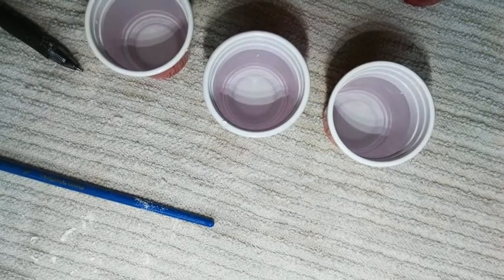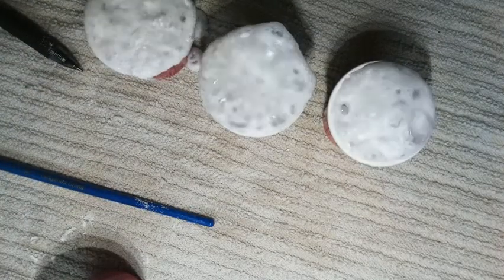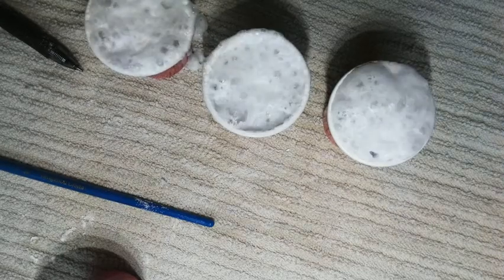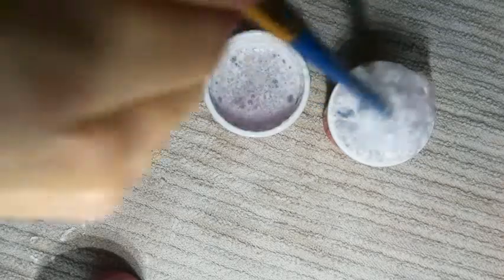All right, let's get these guys situated to go. And we'll dump and get started as soon as we can get the dumping in there. 1, whoa, 2, whoa, 3. Uh-oh, we had a little bit of spillage here. That was a pretty vigorous reaction, wasn't it? Can you imagine doing that with the hot water? This is our room temperature water. Got some crusty bubbles.